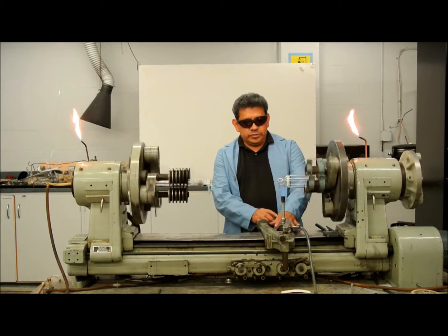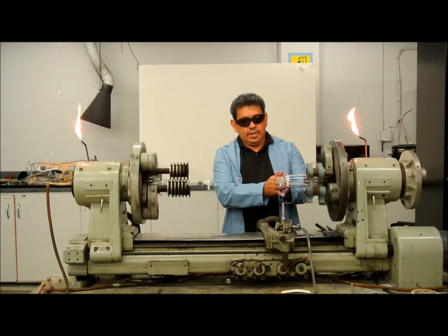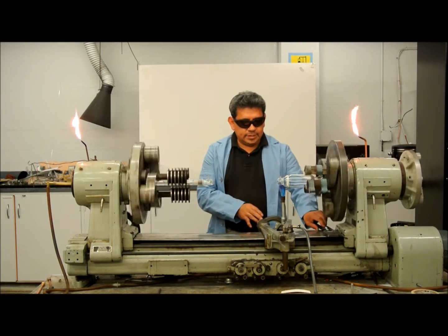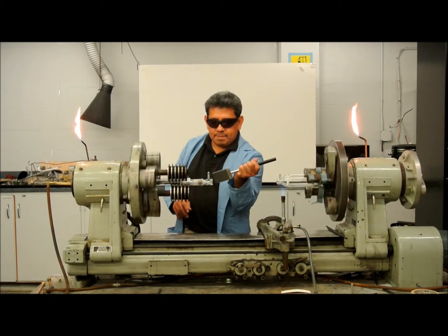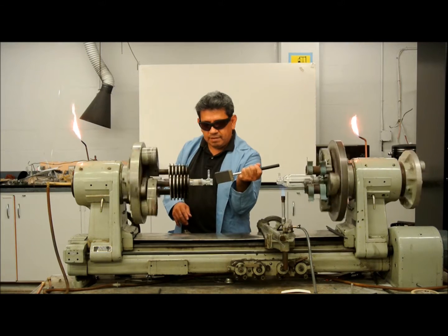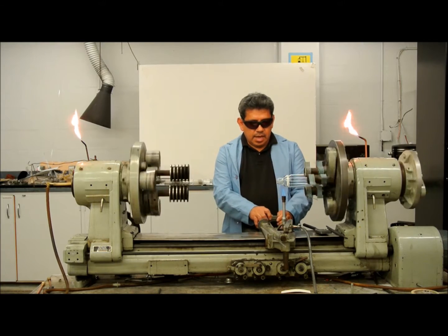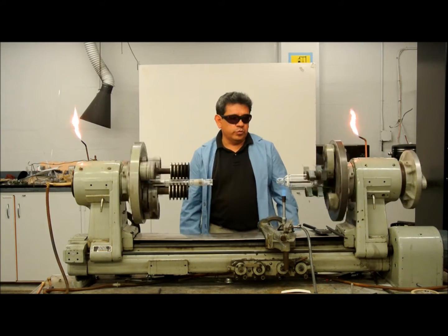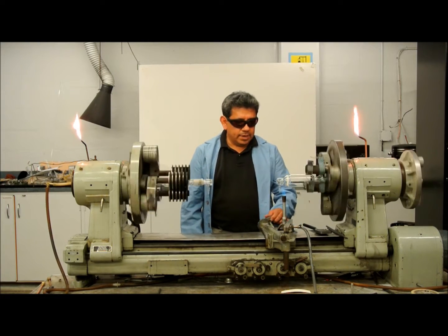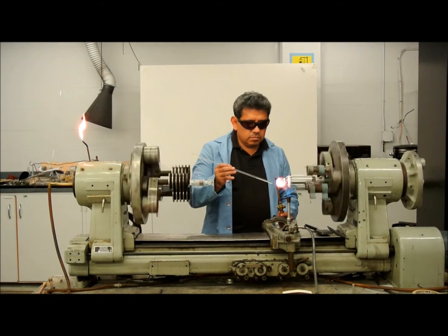I've moved my Bunsen burner a little closer to the frit to warm it up — to warm the frit and the seal — because I'm about to pull it out. At the same time, I'm going to set my adapter into this outer joint to make sure it doesn't come off, because sometimes when you seal them they will come off. I am now getting closer to the frit, warming it up.